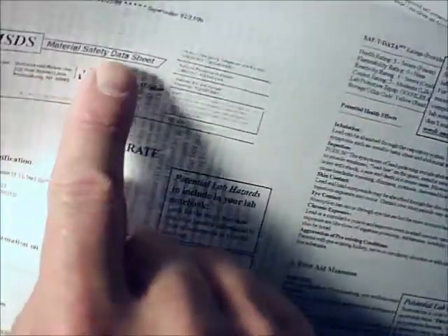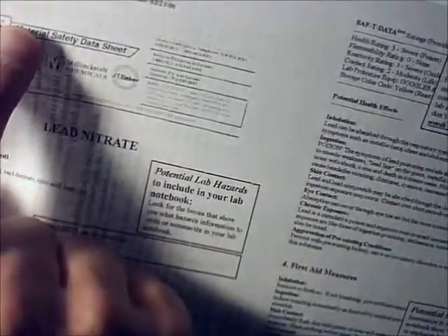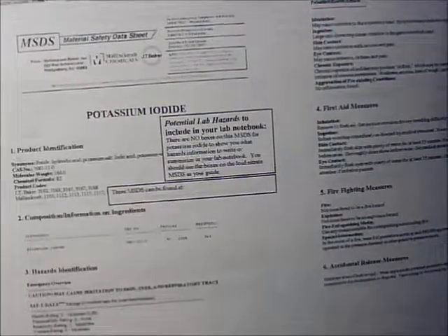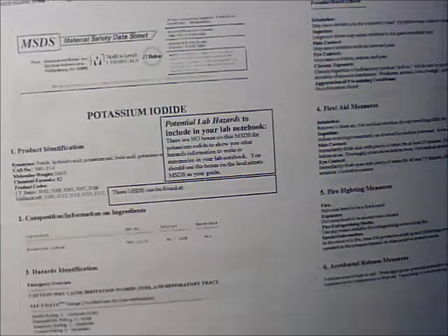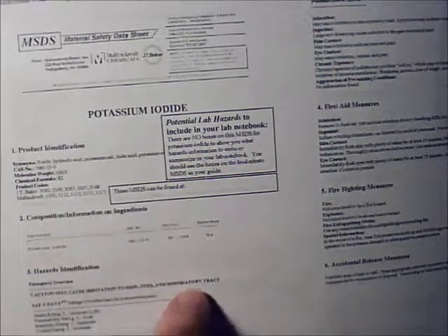Now, I did that for the first chemical. This is a multi-page MSDS for this chemical, lead nitrate here in this case. MSDS. Material Safety Data Sheet. And they're soon going to be called just simply Safety Data Sheets. Now, there's a second chemical here. Don't come in here on the day of the lab and say I didn't know there was a second chemical in there. I'm telling you now.